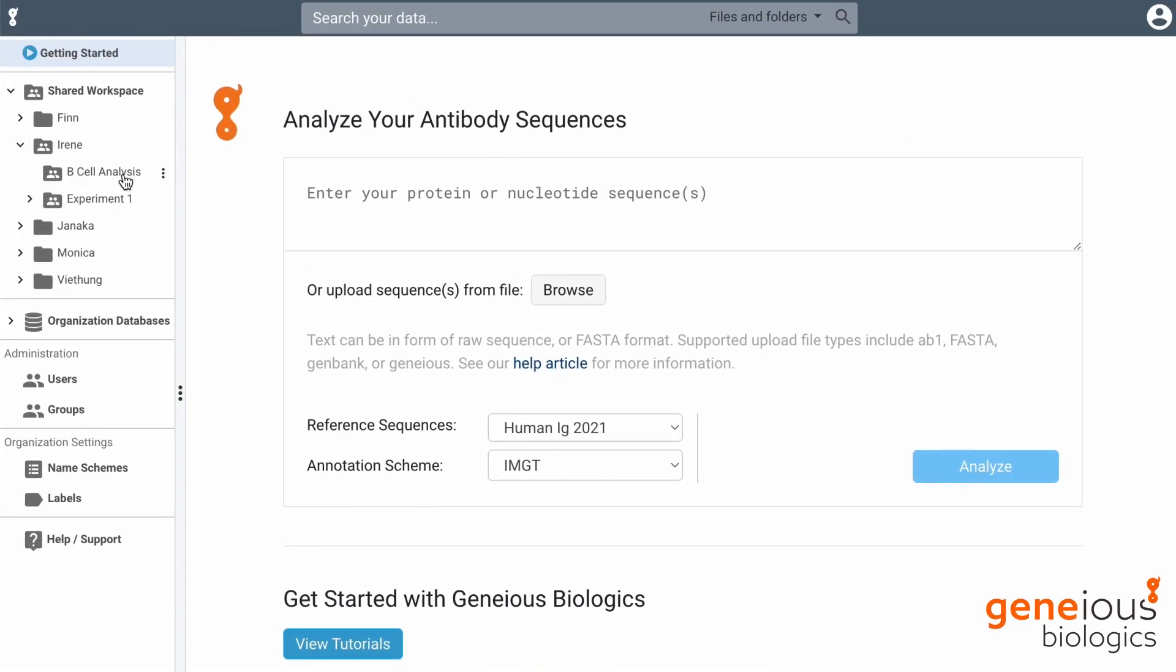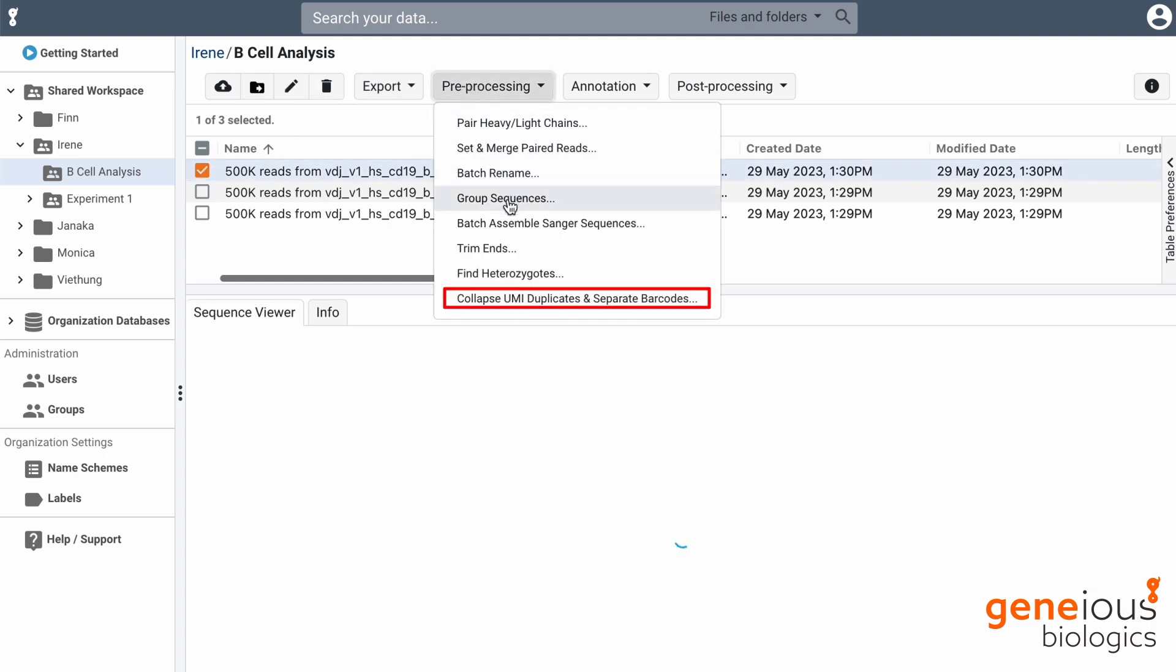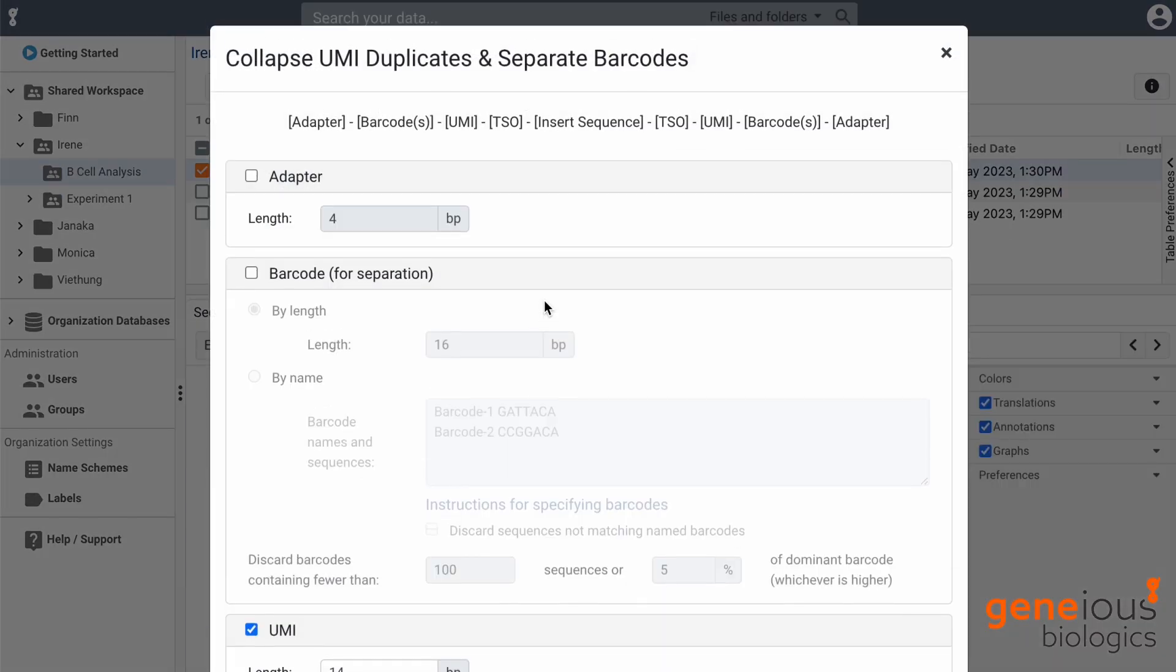The separate barcodes and collapse UMIs operation in Genius Biologics allows you to group and collapse your sequences based on the barcodes and UMIs for enhanced analyses of antibody sequence data.